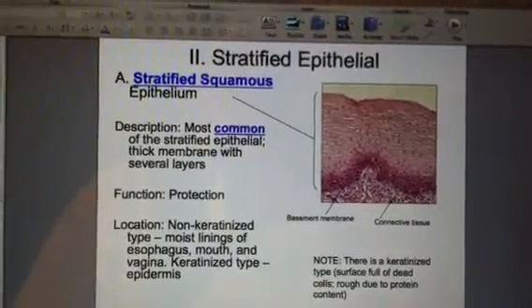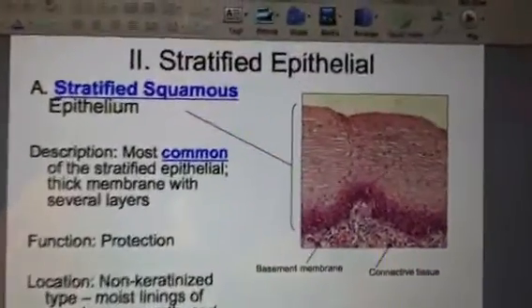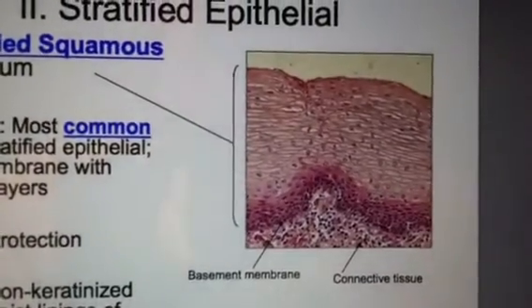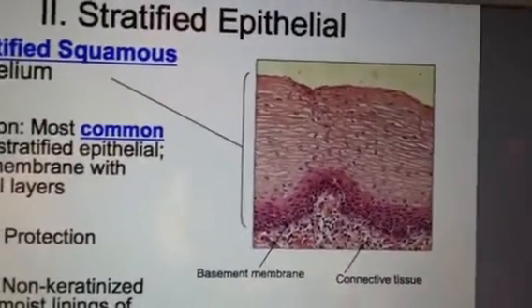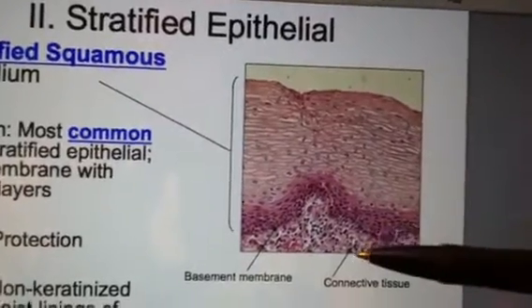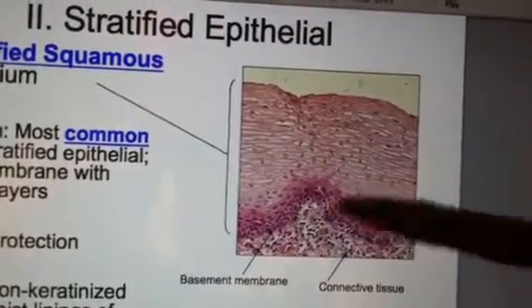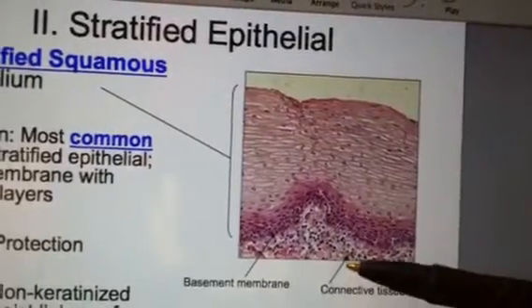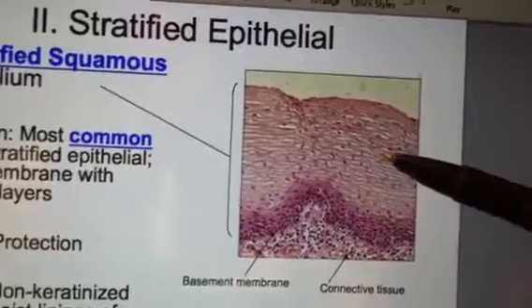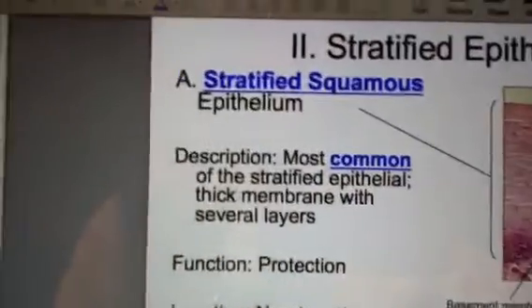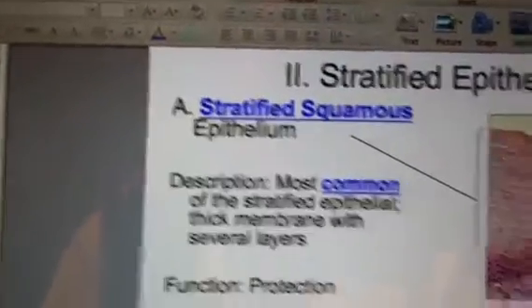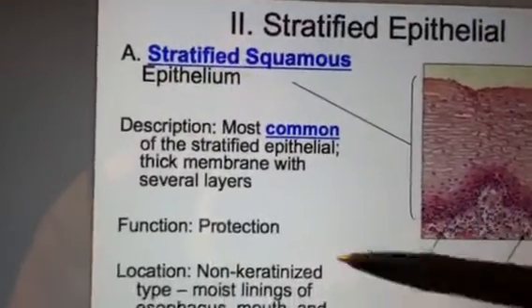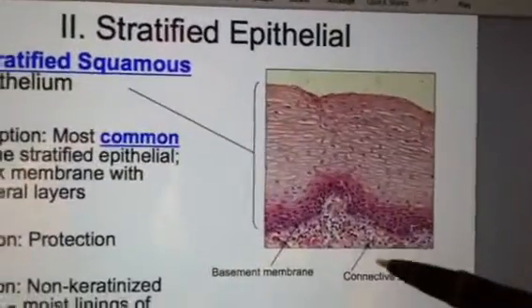You're looking at stratified squamous here, and when we zoom in on the image you can see that there's a basement membrane and a connective tissue membrane on the very bottom — something similar to fat, for example — and this anchors the stratified squamous down onto the body. This is the most common type of stratified epithelial, and it's a very thick membrane with several layers.